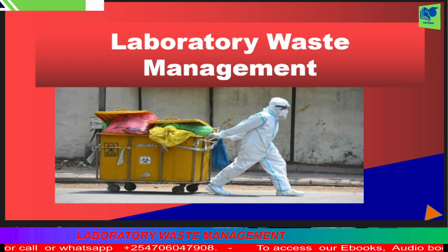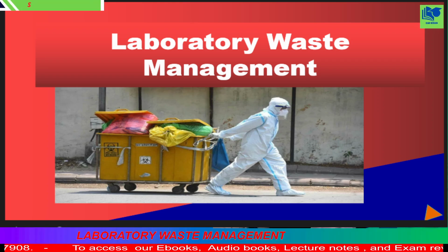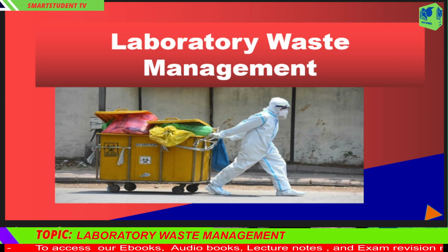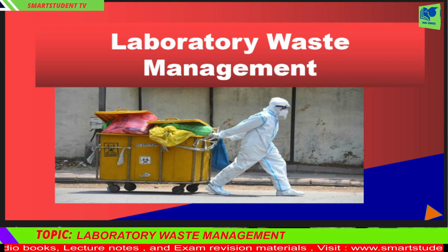Laboratory waste management is not just about keeping the lab clean. It is a critical practice to protect human health, ensure environmental safety, and comply with regulatory requirements. Poor waste management can lead to chemical spills, biological hazards, environmental pollution, and even legal consequences. Therefore, every lab technician must understand the importance of proper waste handling, segregation, and disposal.